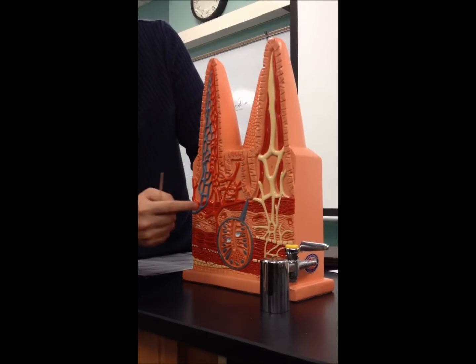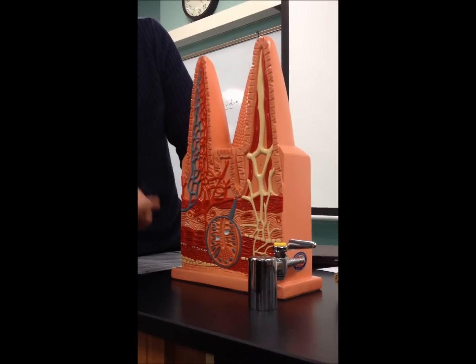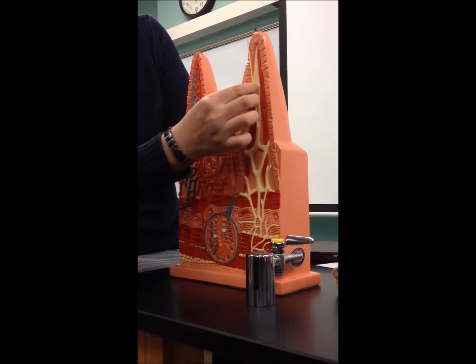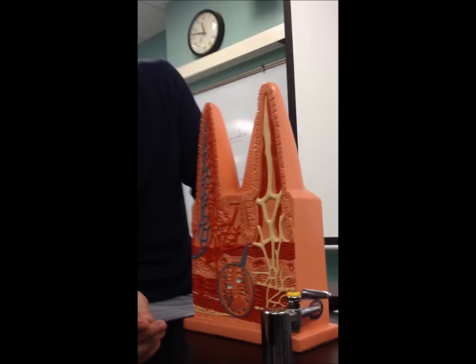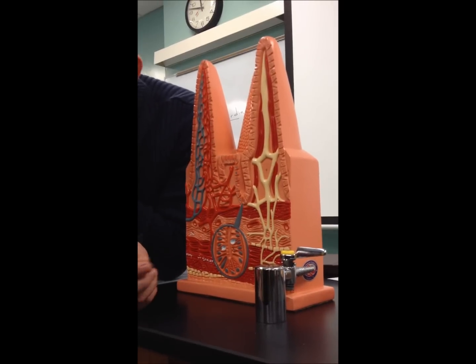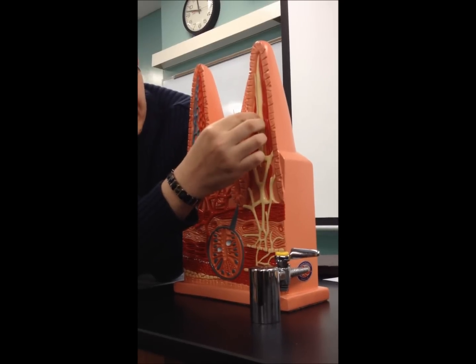Under the epithelial layer, you have the lamina propria, which is a connective tissue layer. All this is lamina propria under the epithelium, which will have blood vessels, arteries and veins, and lymphatic vessels called lacteals. It's very important to know that they are rich in lymphatic supply. All the yellow thing is lymphatic. The main lymphatic vessel is called the lacteal, which is this one.